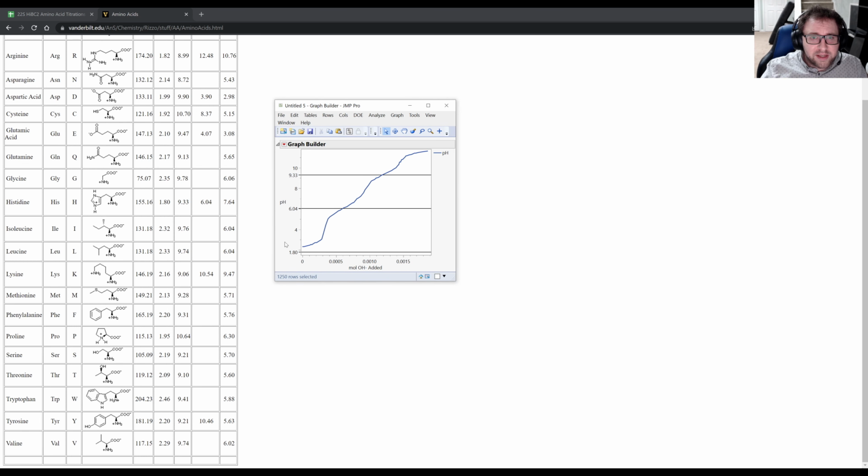All right. The other thing I didn't ask, but it probably would have been a good question is, why does this taper off at the top here? There's no buffering happening here. This is actually just we're getting close to the pH of the titrant. And if you remember that log scale, between log 10 and log 11, that's a tenfold change in OH minus H plus concentration.